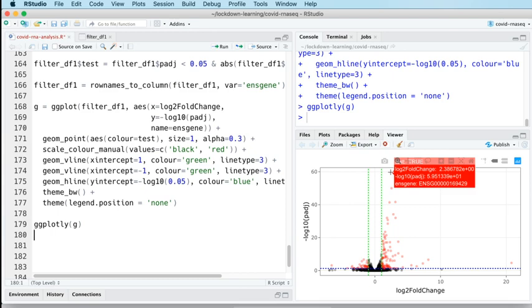And when we've produced annotation, which I think we will do tomorrow, we'll add the annotation on, and then we'll do the third visualization after we've done the annotation, so probably on Thursday. We can replace that Ensembl gene ID with the gene symbol, so something that's slightly more human readable. And this then becomes quite a useful visualization of this. Yeah, unfortunately, with 16,000 data points, the interactive volcano plot gets a little bit cumbersome.